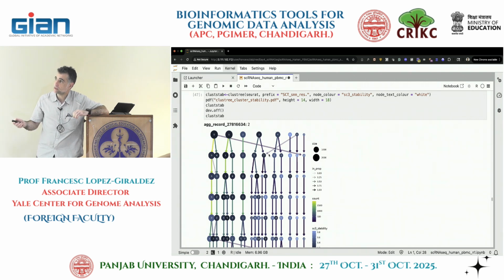These are the number of clusters we found at 0.2. When you increase resolution, the first thing you notice is that we increase the number of clusters that we find. So clustering may not mean anything biologically relevant to you, because by default we just use 0.8, but what if we had used 1.2? We're going to encounter more or fewer clusters depending on the resolution we use.